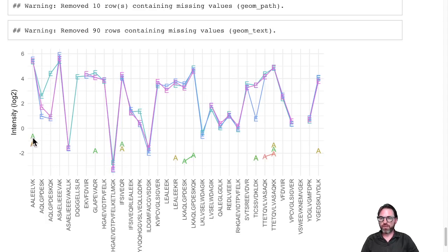If we focus on condition A, the low spike-in concentration, we see that only very few peptides are identified and quantified and available. The reason for that is that the concentration is so low that we can only pick up peptides that fly very well through the mass spec. So all the peptides that we find have typically high intensities. And all the peptides that have lower intensities in concentration E are not found back for A because they simply cannot be detected.